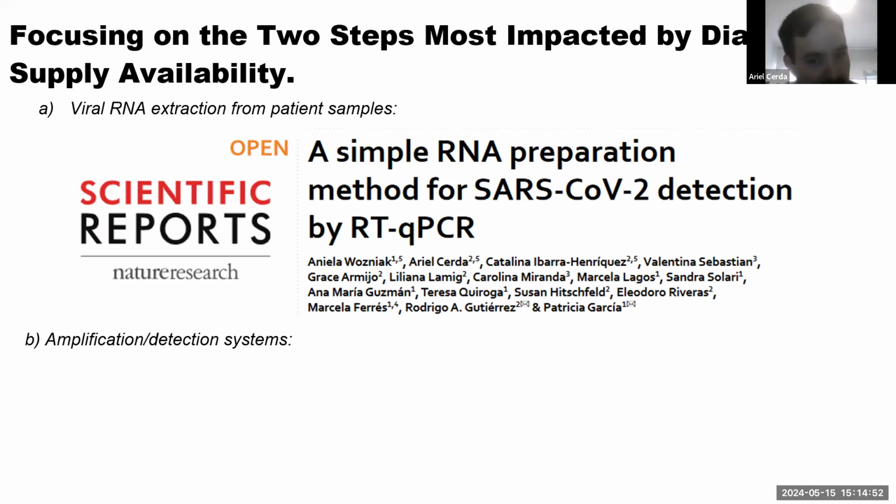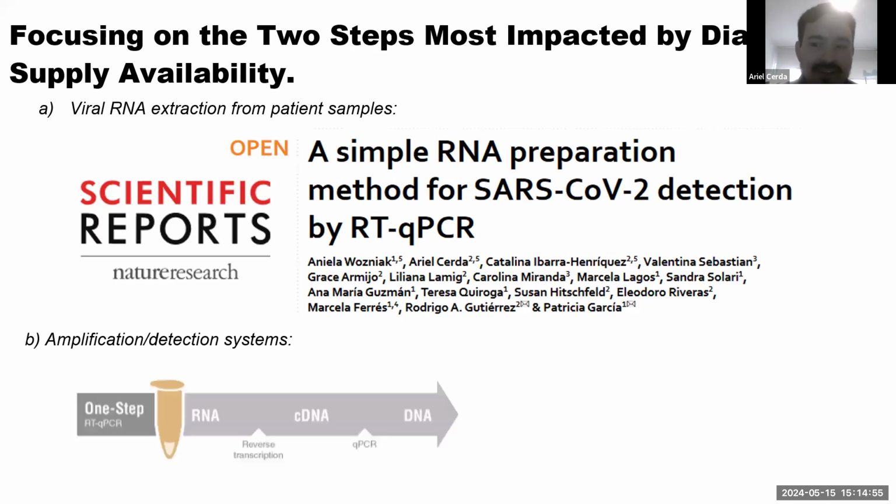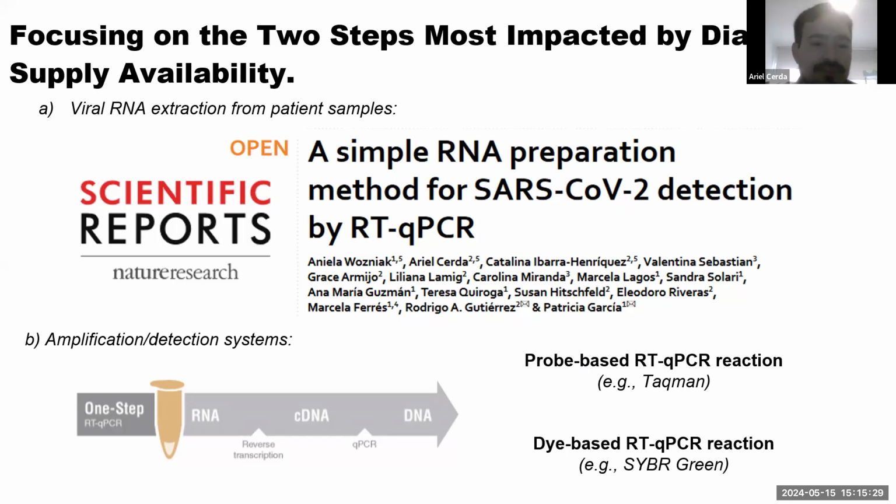As for the viral RNA amplification and detection system, which typically involves RT-qPCR, we decided to develop an open one-step RT-qPCR kit. This decision was mainly because one-step procedures are preferred, as they help to avoid potential pre-analytical errors that can occur during sample preparation, optimize reaction times, and facilitate automation. Additionally, we decided to work in two parallel options: one relies on specific probes, and another is based on dyes with affinity for double-strand DNA.